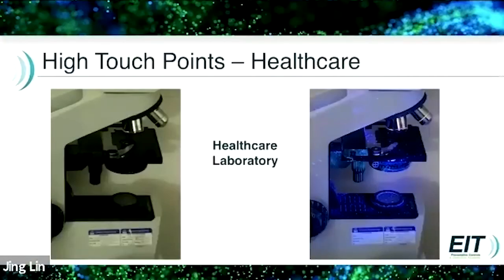A healthcare laboratory microscope looks fabulous in the first picture — but in the second picture, there's a lot of contamination there. You've got to think about how often those get cleaned and how detailed the cleaning is.